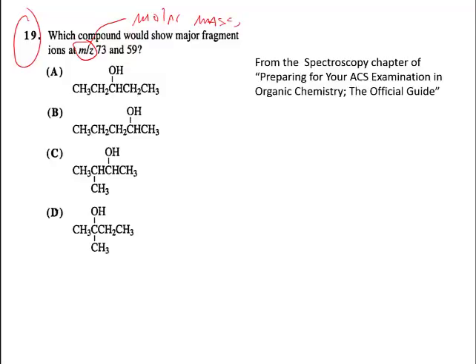The reason they do that is if 2 electrons happen to come out of a molecule rather than 1, it's going to deflect that beam twice as far, and so what you will see is it's more relevant, the mass to charge ratio, as opposed to simply the mass. Having said that, it's almost always true that a single electron comes out of the molecule rather than 2, and so we're just going to think of that as molar mass and be done with it.